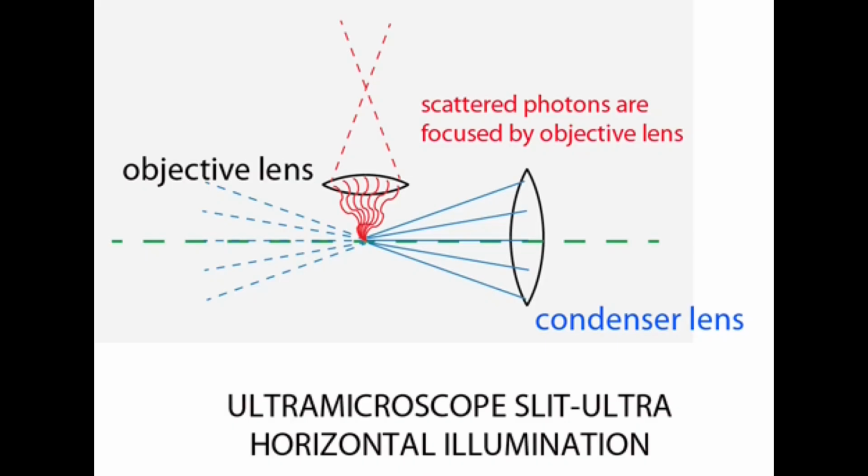If a neighbouring particle is closer than the limit given by the Rayleigh criterion, the particles become merged in the image. Note that some of the lower order light is closer to the horizontal, so in this method it does not enter the vertical objective.